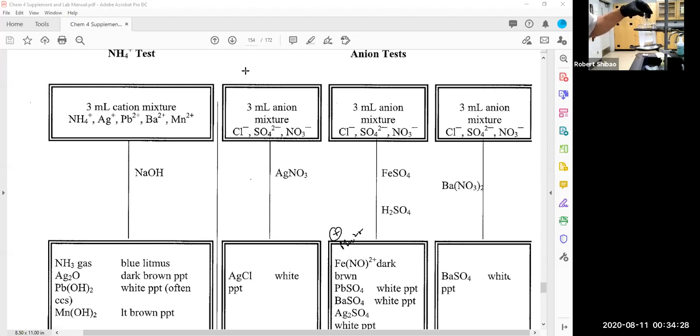Now this is bumping a little bit. Did you hear that noise? This test tube can be hot too, so I can use a test tube clamp to hold it as well. So we'll just keep heating that. So that was unknown B, and it looks like it's negative for ammonium. Here, still not blue. I want to do one that's positive for ammonium, so hopefully the next unknown will have a positive test for ammonium.